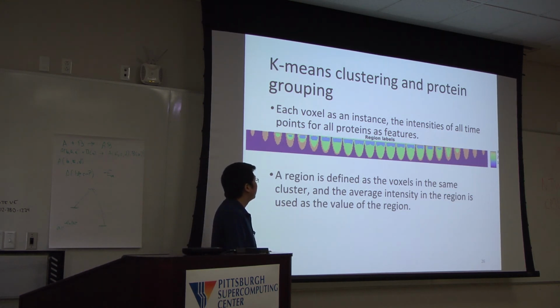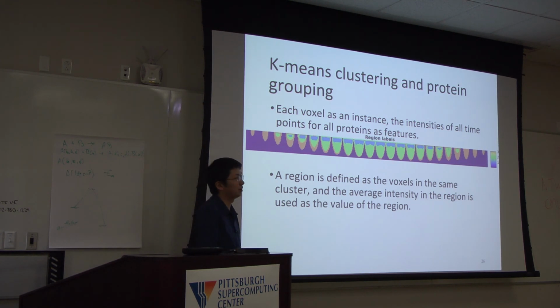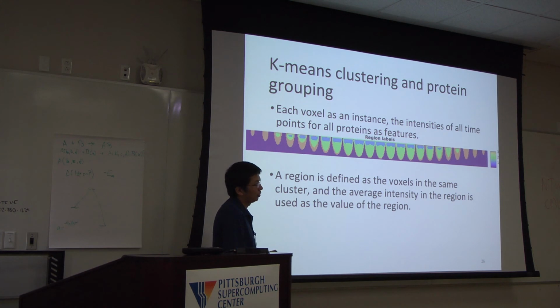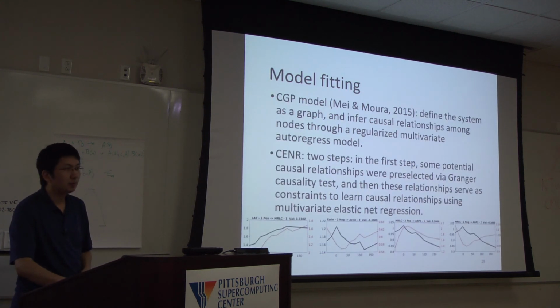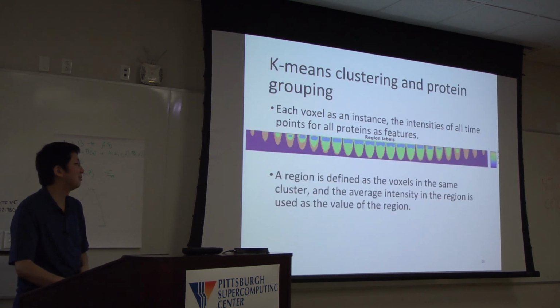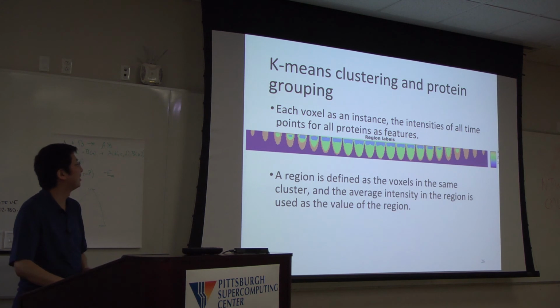And for the temporal resolution, because we use existing data and it's decided by our collaborator, we cannot increase it. Also, for taking movies of live cells, it's very hard to increase temporal resolution because there are 3 stacks. You need to take all the stacks before you move to the next time point. It takes a long time. Maybe I can suggest to my collaborator, if they have money, we can do that.